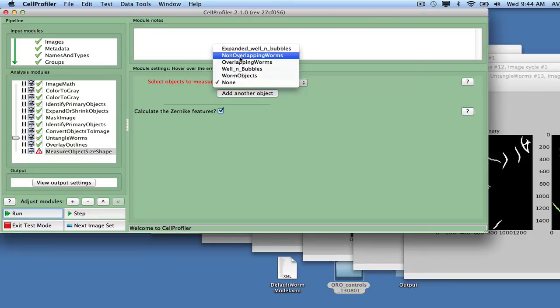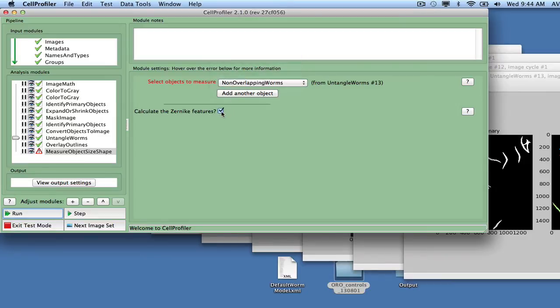We start by adding Measure Object Size Shape to the pipeline and measure from the non-overlapping worm objects. Be sure to deselect the Calculate Zernike Feature settings since these measurements are not relevant in this context and add computational time.